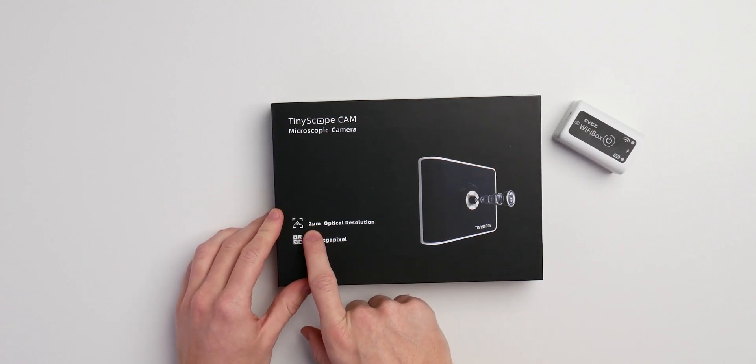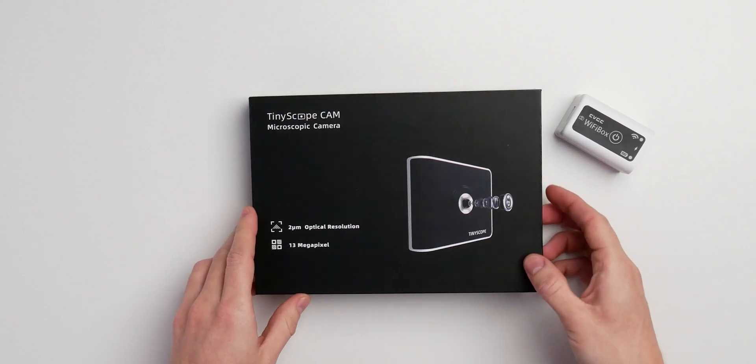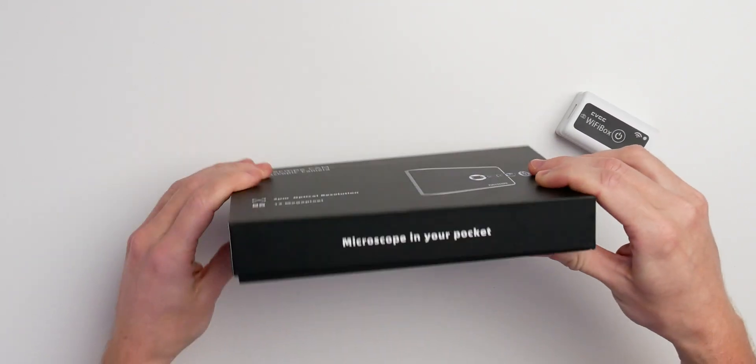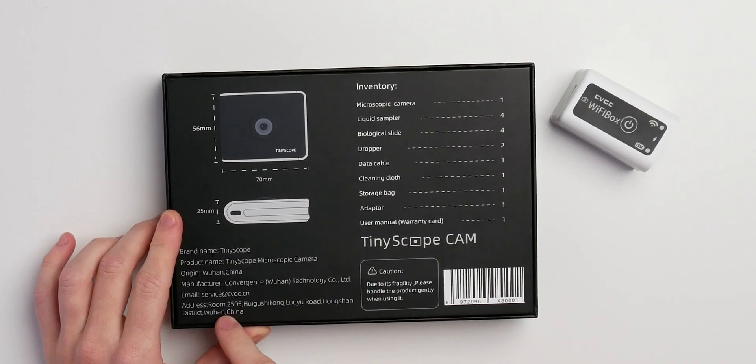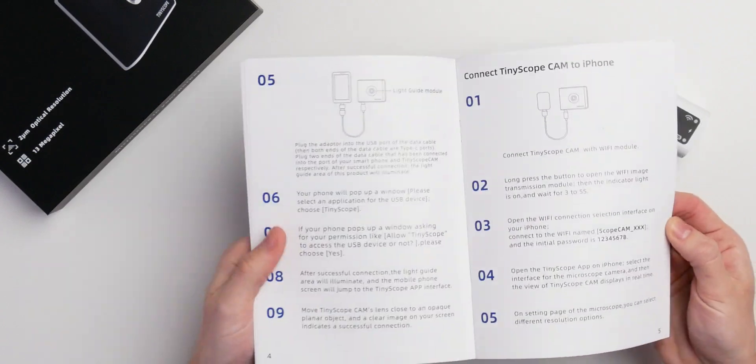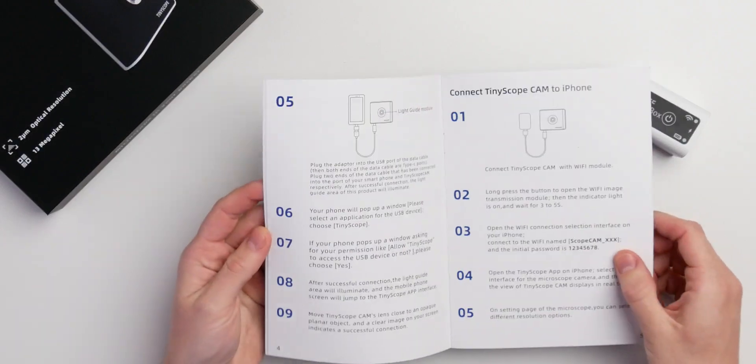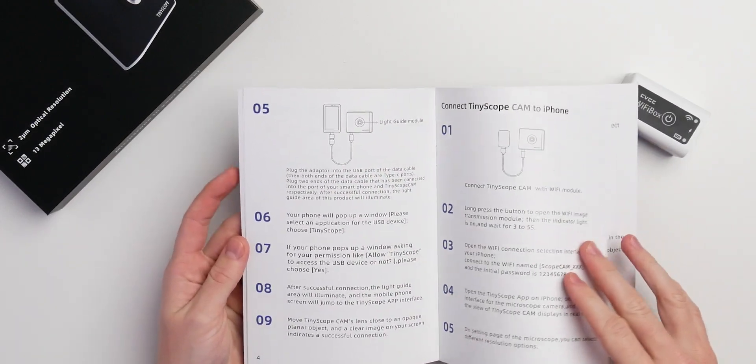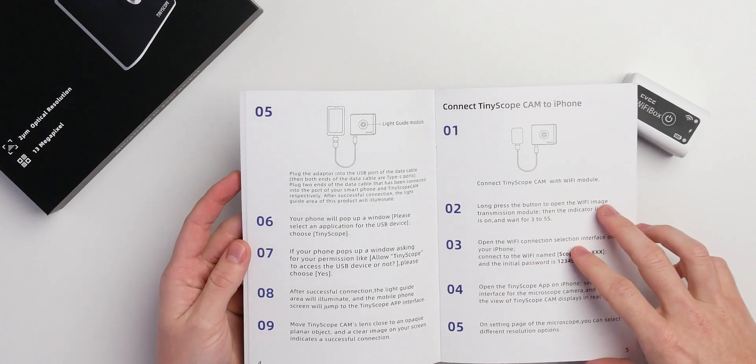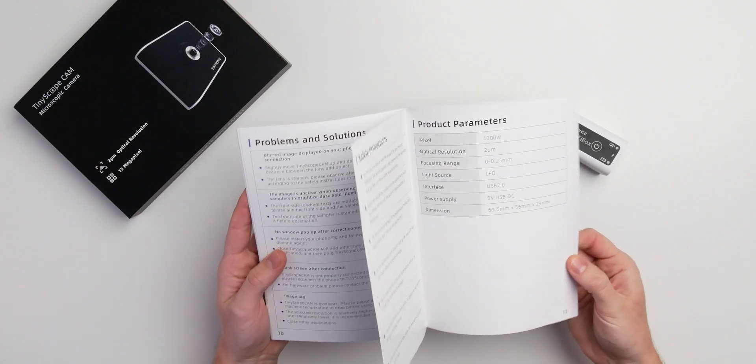So the TinyScope is claiming to get up to 2 micrometers optical resolution, 13 megapixels and it looks like this. The footprint is just pretty okay in my opinion. Also just some samples you can get a first impression of it, I really like it. The very first thing you'll notice is you get a really good manual I must be honest. It's written really big and quite good on the other side. So you can just use the OTG mode from your phone or just with your WiFi model for your iPhones.